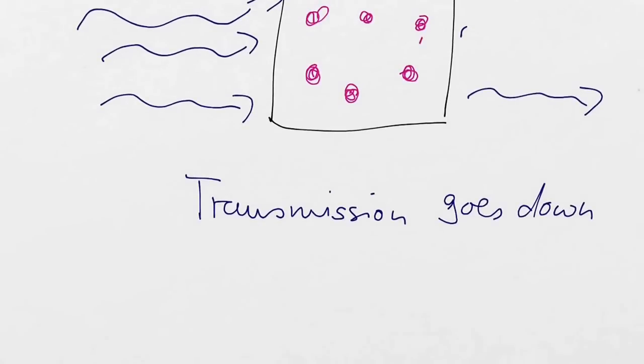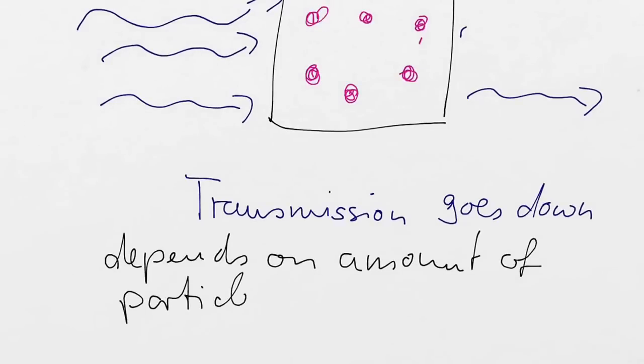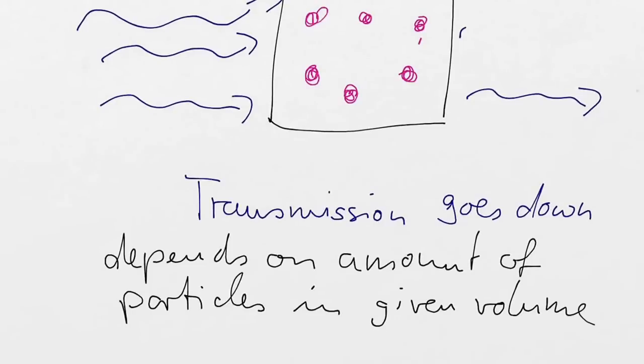So, transmission depends on the amount of particles in my container, in a given volume. Yeah?